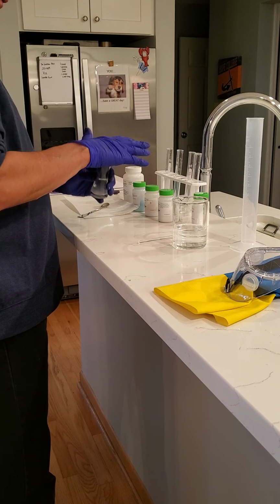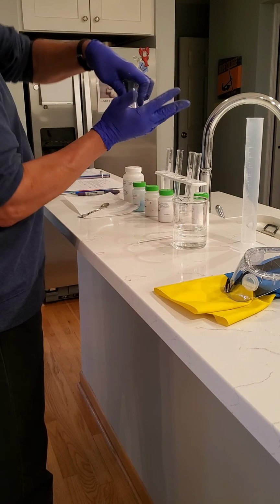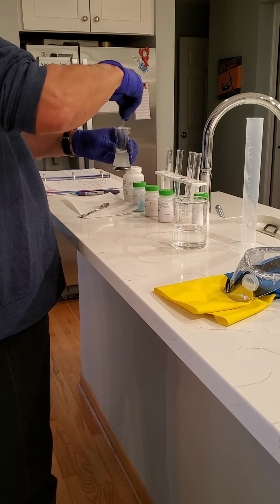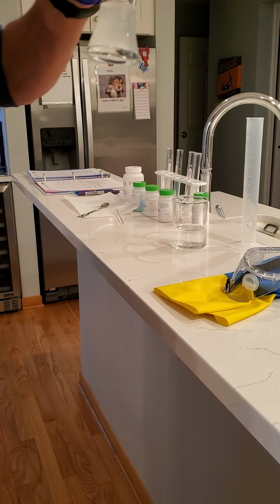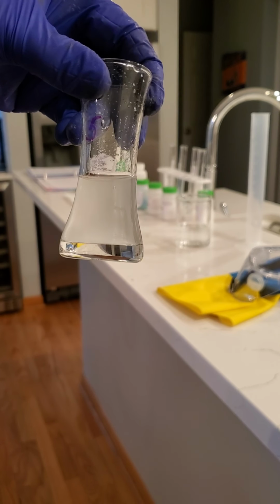And I'll just hold my whole hand over it, and I'll shake it upside down like this, just to kind of mix it. You can actually use your stirring rod too. And we'll see what the tetraborate looks like initially.